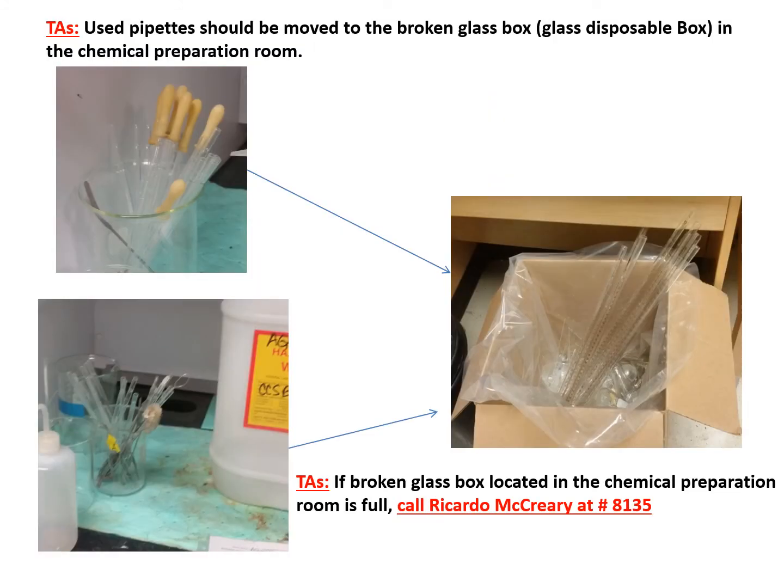All right, and in terms of the pipettes, like I talked about earlier, on the top left picture, you see some glass pipettes in a beaker and little rubber bulbs. Those bulbs are what you use for the suction. Now, we keep the bulbs. Those can be reused, so don't throw those away. But the glass pipettes part, they go in that brown box on the right-hand side. It's labeled glass, it's got a picture, and it's specifically made for any broken glass. Any glass at all that is chipped, shattered, cracked, whatever, pipettes, etc., they go in that broken glass container, and only in that, nothing in the garbage, because different people take these things for chemical decontamination, recycling, and we don't want the normal custodial staff to pick up a garbage bag full of broken glass. Got issues there, so that's how that works. So make sure everything is disposed in the correct container.